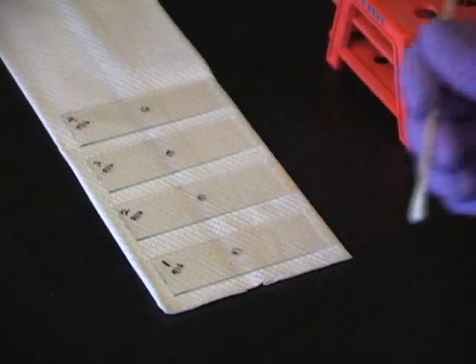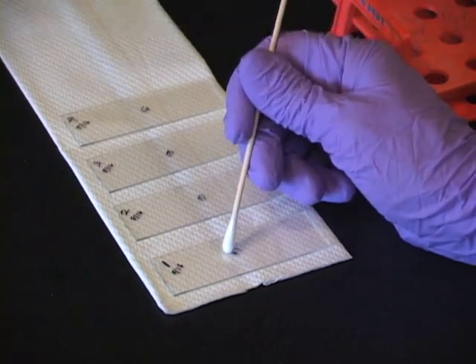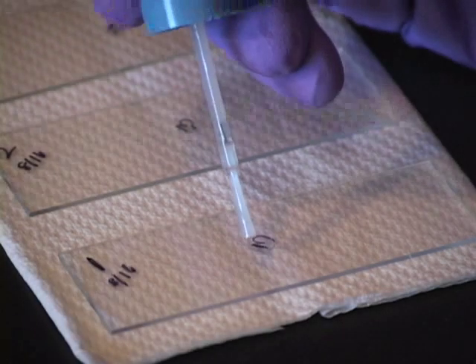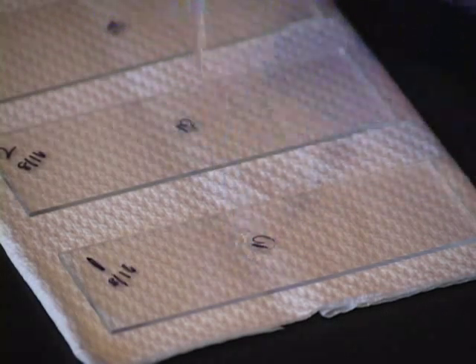Remove excess Citifluor around the edges of the coverslip with a cotton swab applicator. Carefully seal the coverslips around the edge with nail varnish.